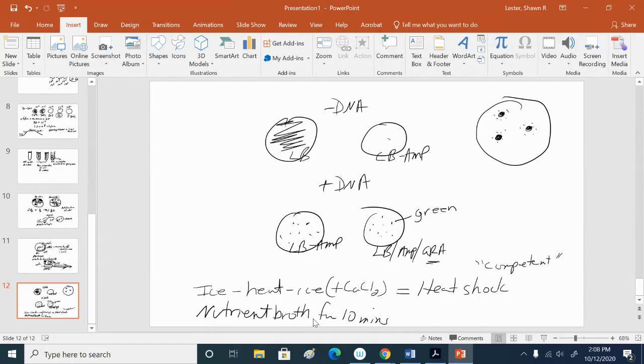Because the main bacteria destroyed the. Well, but what were the satellites? I mean, what are they? Tell me what they are. They're bacteria, right, they're just plain E. coli, right? And so we already showed that plain E. coli is killed by ampicillin. So then how come they're growing on plates with ampicillin?